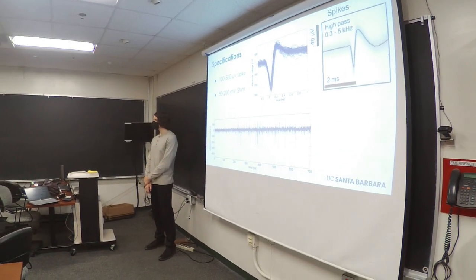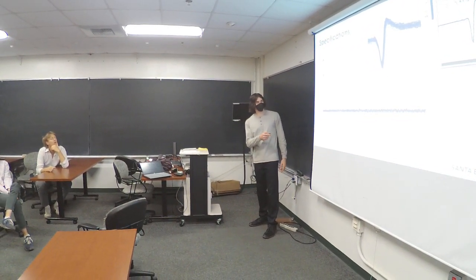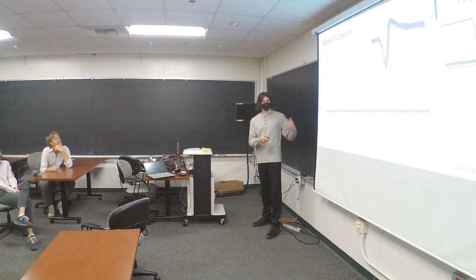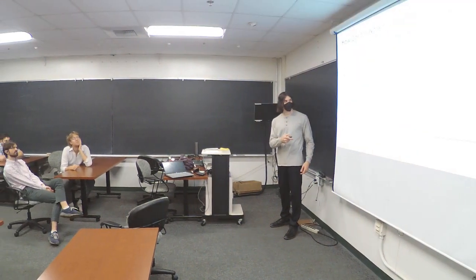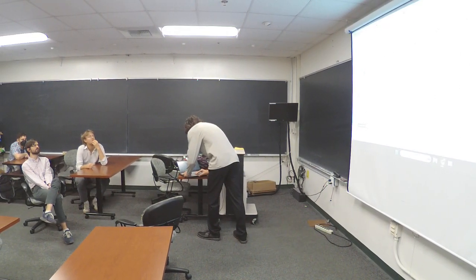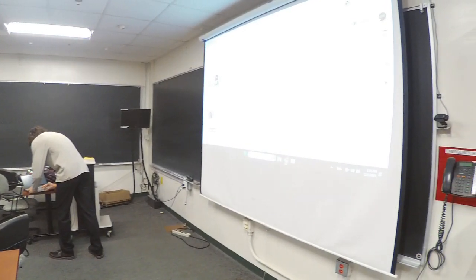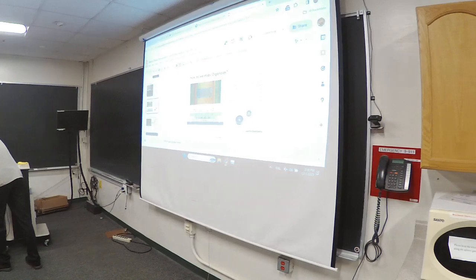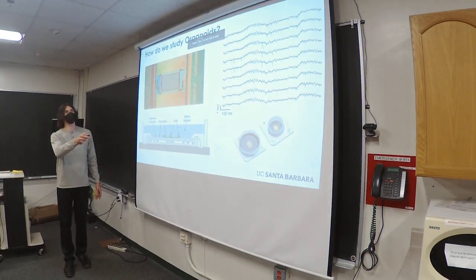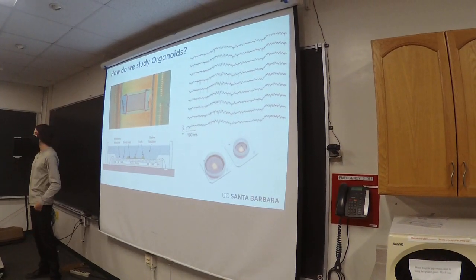And those are just like baseline shifts? Yeah, so this is all the way at the beginning of the presentation. But this trace has actually already had all of that filtered out. I did show it at the beginning, but I'll show it again. There we go. You can see how there are these curvy bits that you want to get rid of if you want to see exactly what's happening with a particular cell.